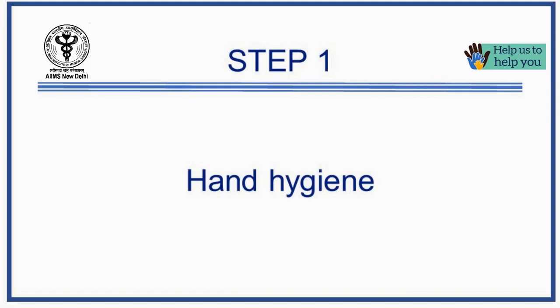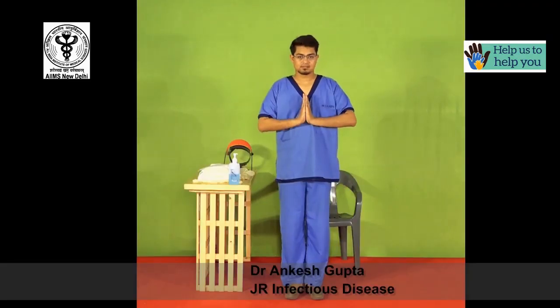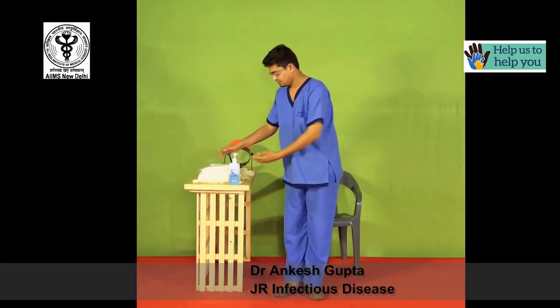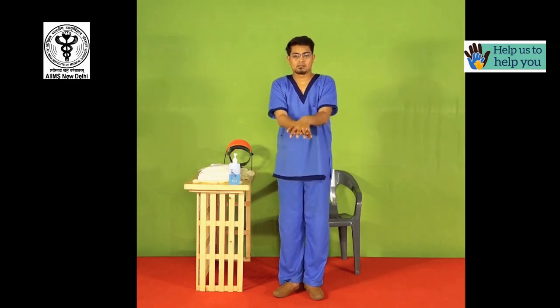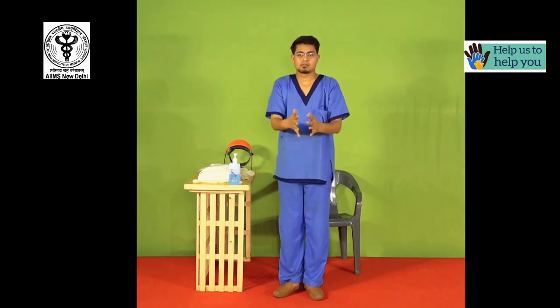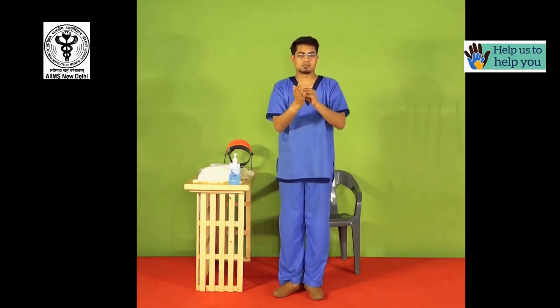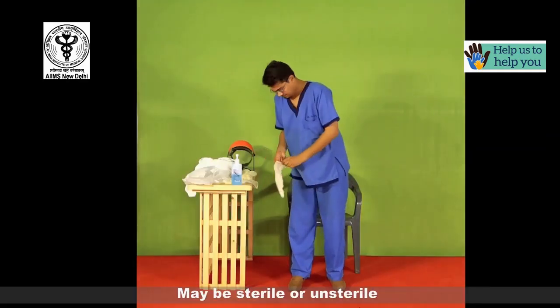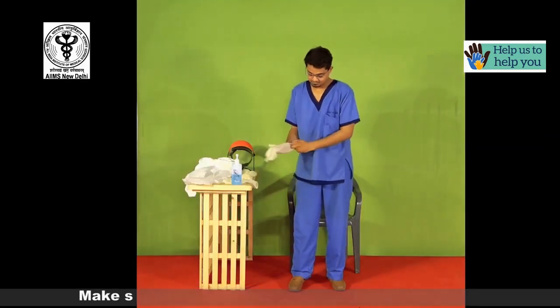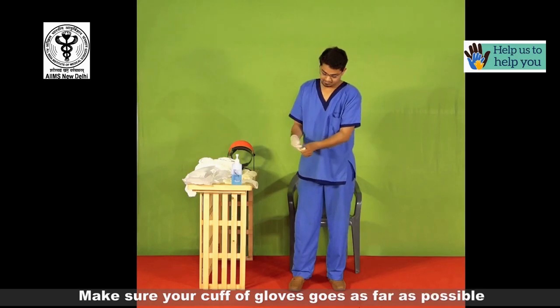First, perform hand hygiene. Wear the first pair of gloves, which may be sterile or unsterile. Make sure that the cuff of the glove goes as far as possible.